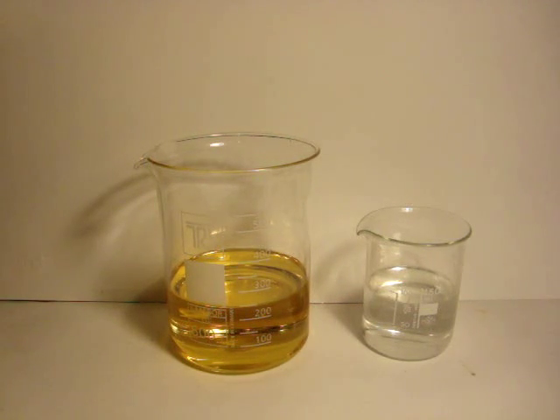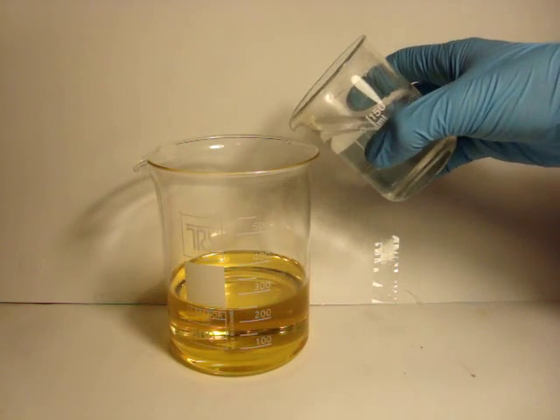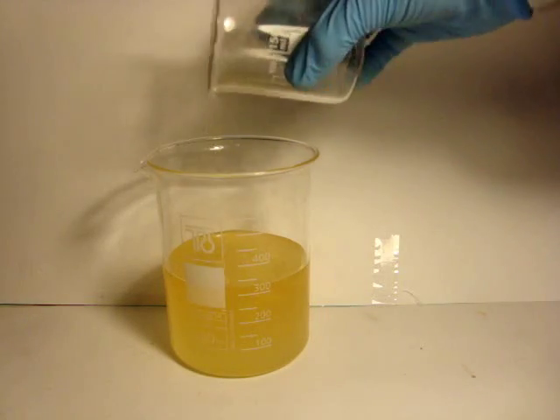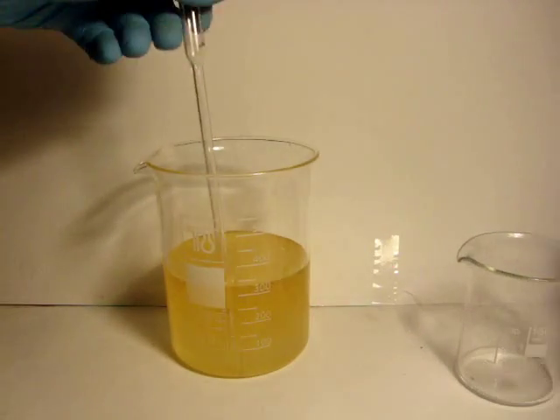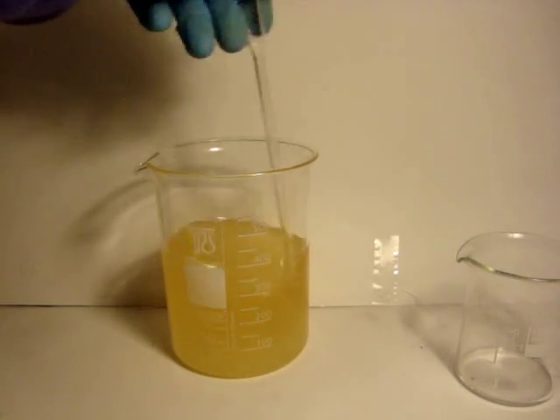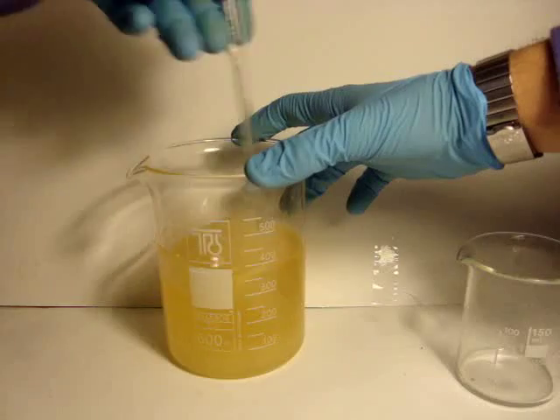Let's start with 250 grams of seed oil put in a large beaker. In the other one, you are going to put 32 grams of sodium hydroxide into 75 grams of water. Now add the hydroxide solution to the oil. The reaction will start immediately, making the oil dull. You have to help the process by mixing with a glass rod.